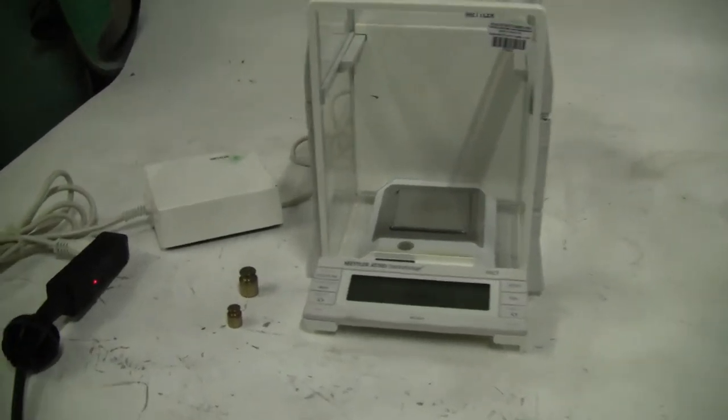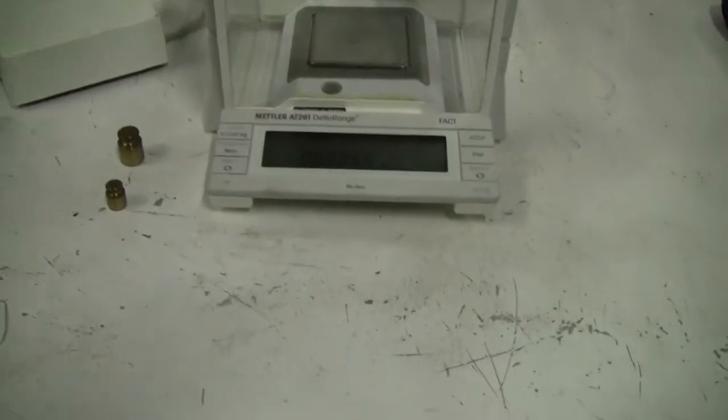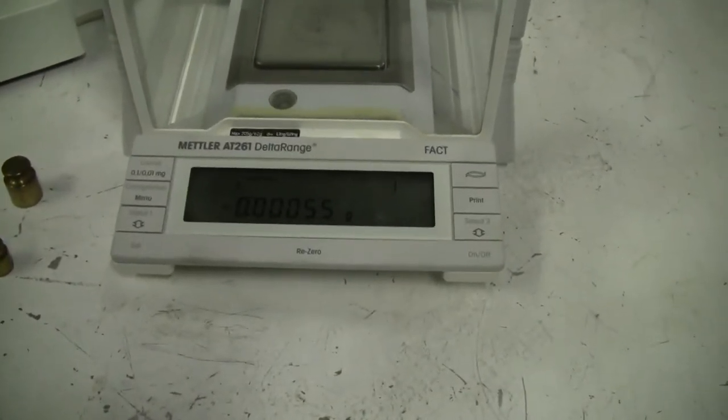Hi, it's Jim from HitechTrader. Today we're looking at a Mettler AT261 Delta range analytical balance.